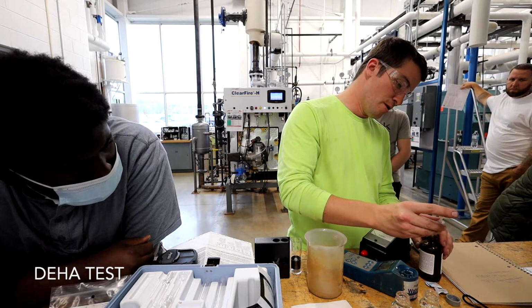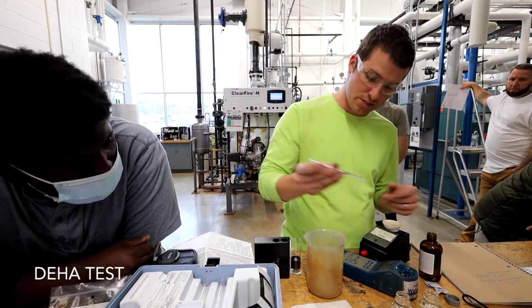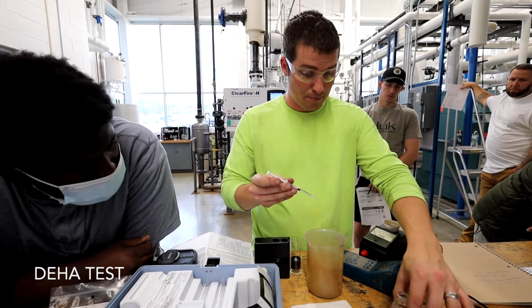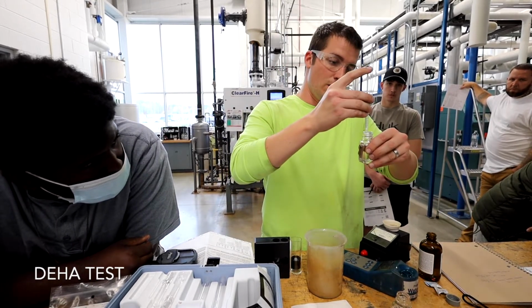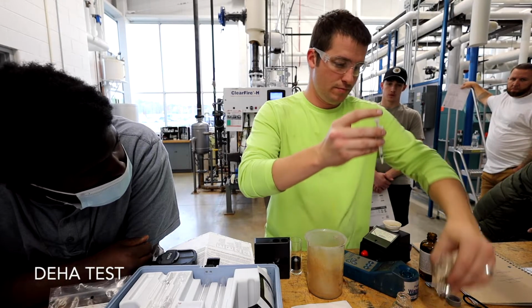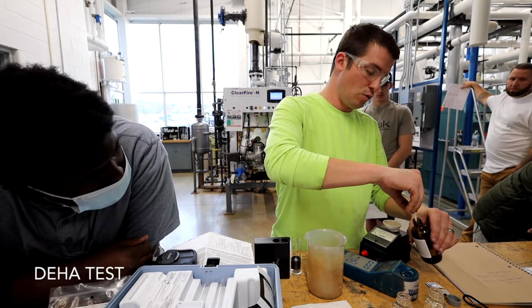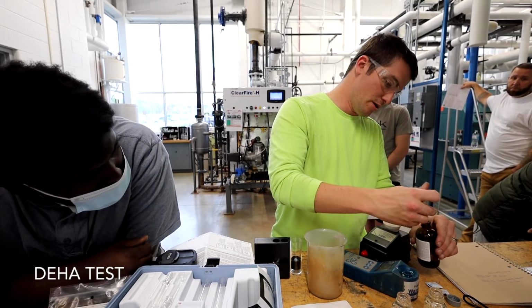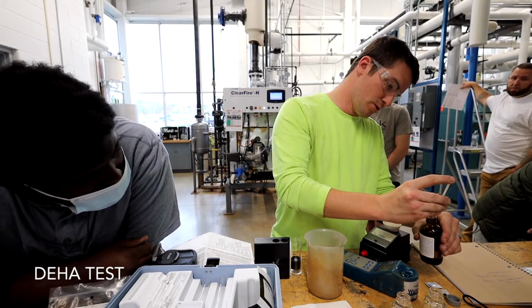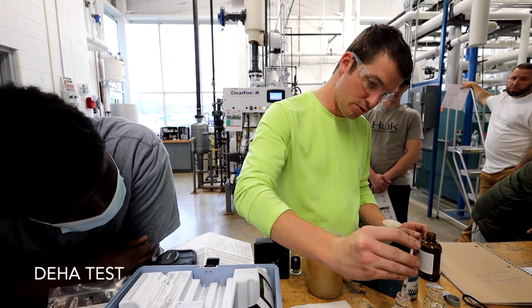So I normally put the bottom of that black stopper on the 0.6, and then in both you're adding 0.5. So now I'm gonna push that down to 0.1, and then whatever is left, yeah, 1 little drop, which probably wouldn't impact the test, but we're gonna follow the instructions. So then again, I'll push it to 0.6, and then from 0.6, I'm gonna push it down to 0.1.